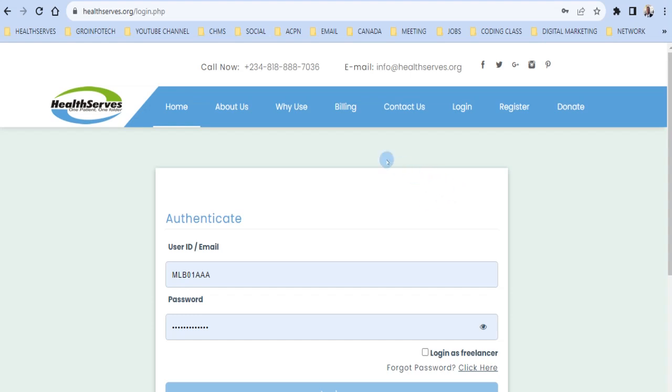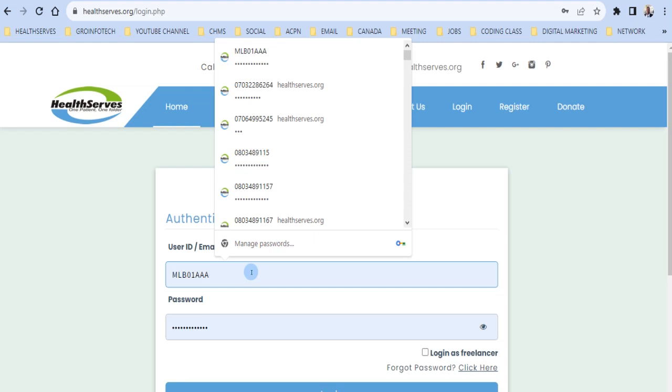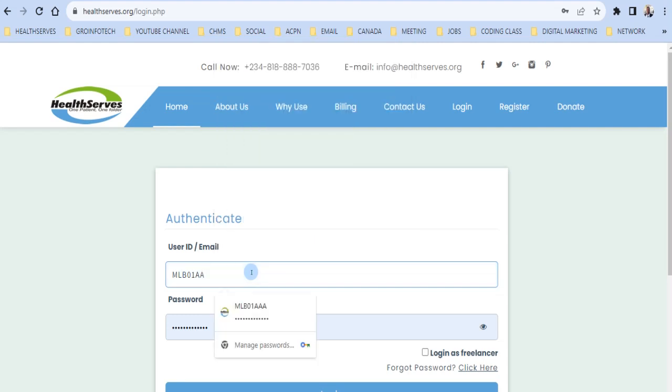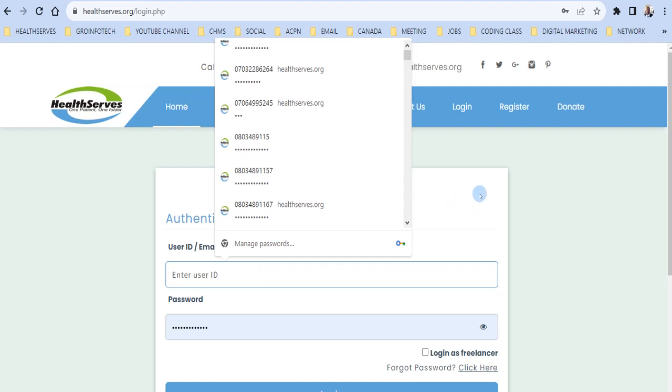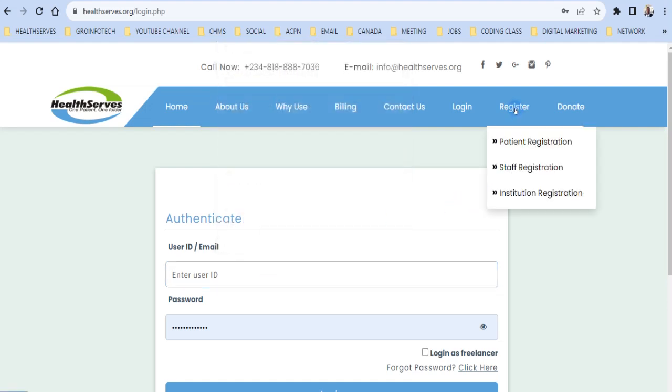In this video, we demonstrate how you can use HealthServe to manage your medical lab investigation from start to finish. Your staff must be enrolled in your lab account, so to start with, let's look at how you create your lab account.